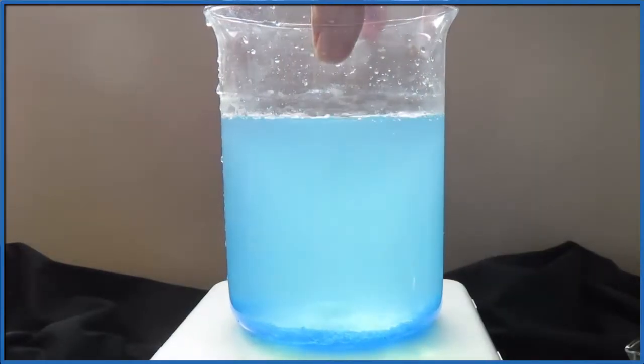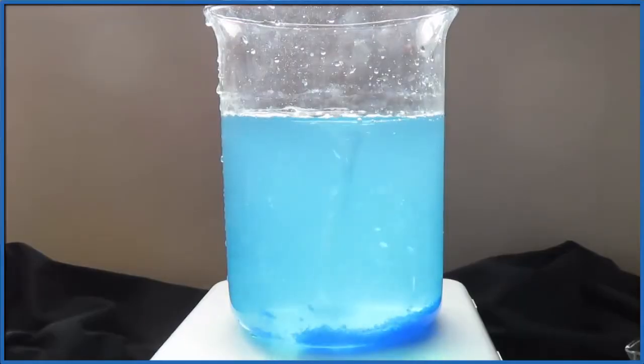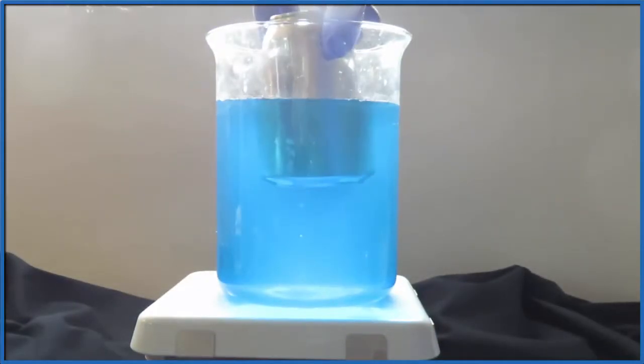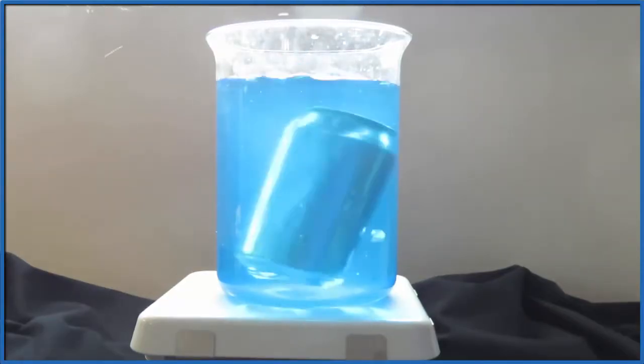Now, when we put the can in, the aluminum should react with that copper-2-ion. So we have our shiny aluminum can. We put it in there with those copper-2-ions and the sulfate ions. And the reaction starts pretty much immediately.